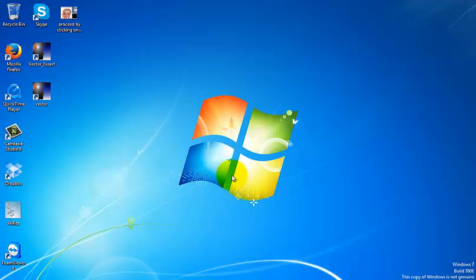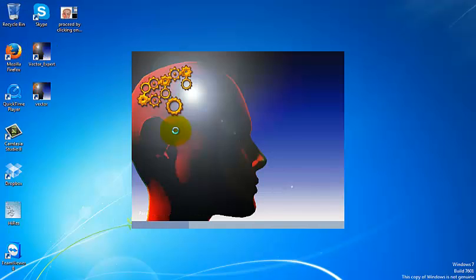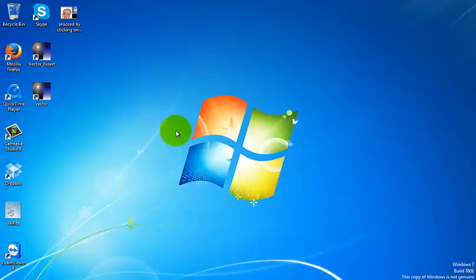I'm going to start off by clicking the Vector Expert icon on my desktop. The new icon is going to take a little bit longer to download. Maybe for some computers it takes a minute, for some a little bit less. If it takes a little bit longer, don't worry about it.